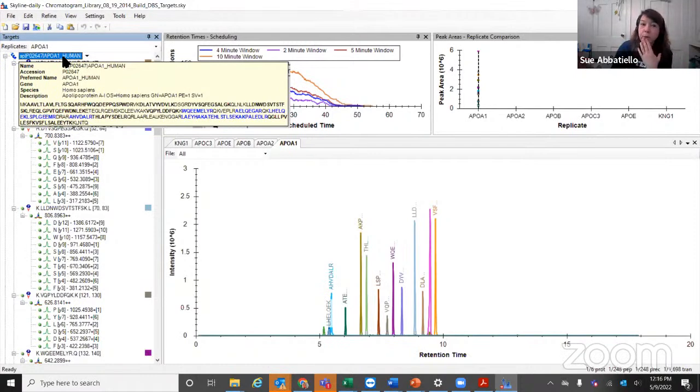One thing I want to point out first is this one has an N-terminal methionine, which is usually the signal sequence, and often proteins are processed after translation and have this methionine removed. If you're not sure of what state this protein is in, I would say don't target any peptide that includes that first amino acid in the N-terminus.